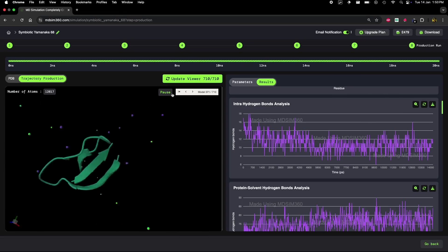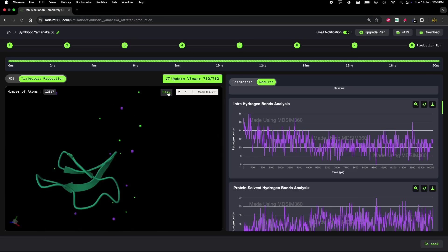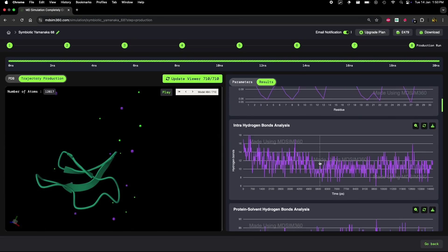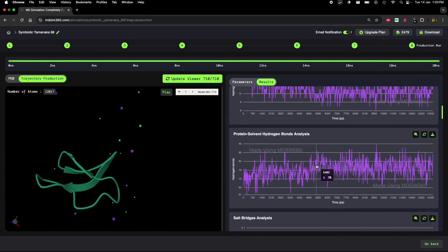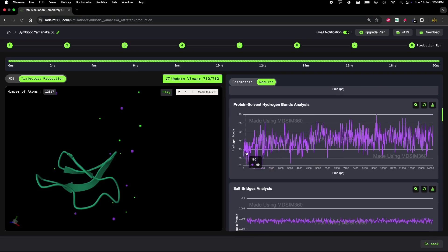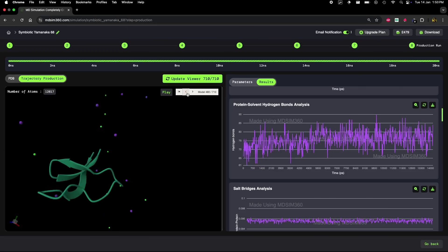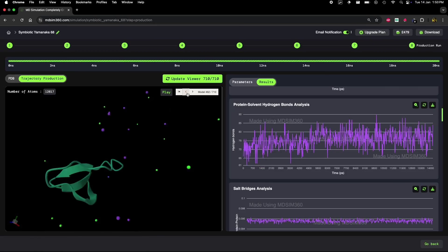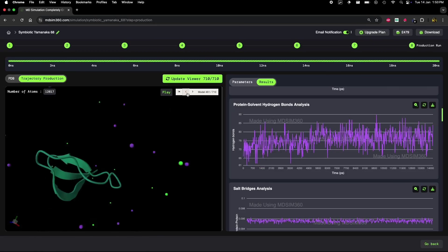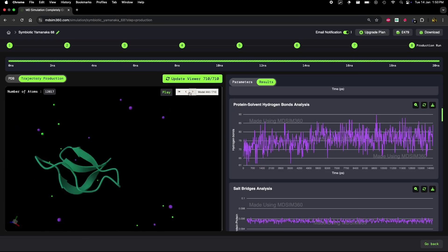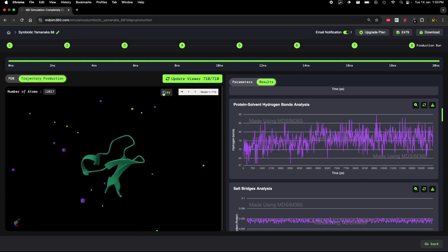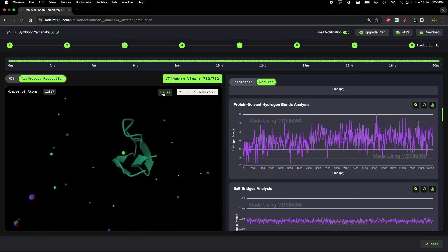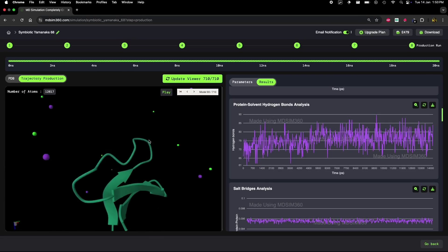MDSim360 makes it easy to track all these changes in real time and correlate them with visual trajectory data, which is incredibly powerful for understanding protein dynamics. Thanks for tuning in. I hope this breakdown helped you understand how to use these analyses effectively. Stay tuned for more videos where we'll dive even deeper into molecular dynamics and how to make the most of MDSim360.